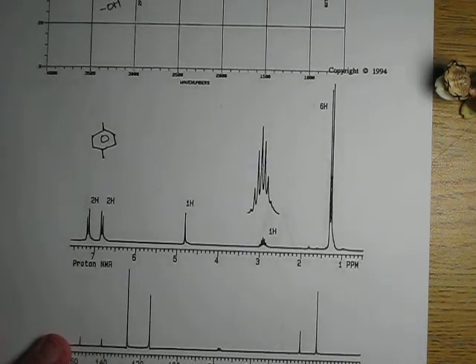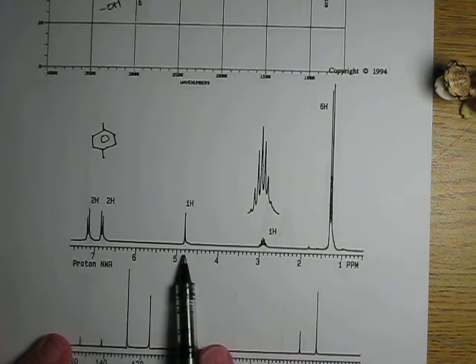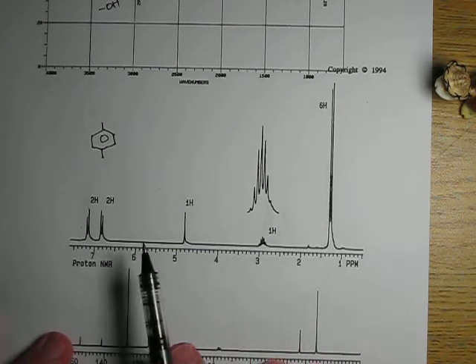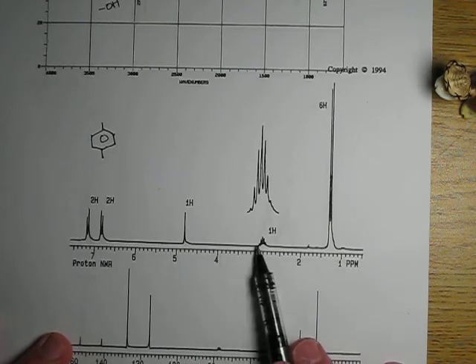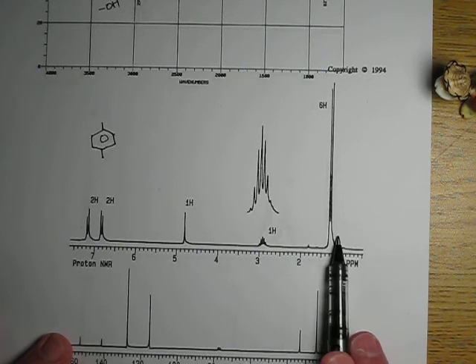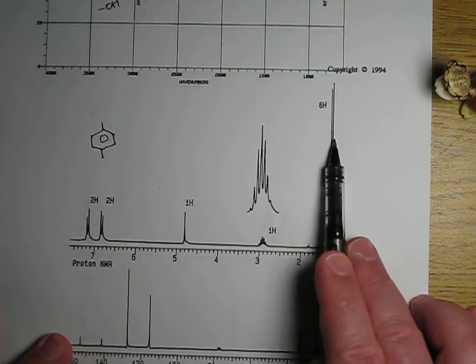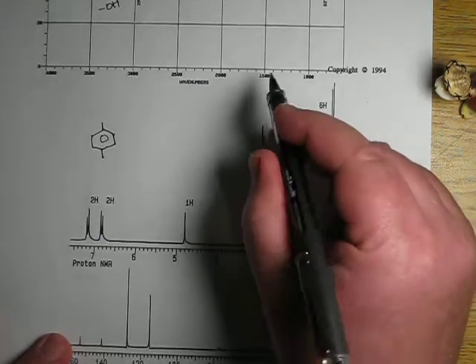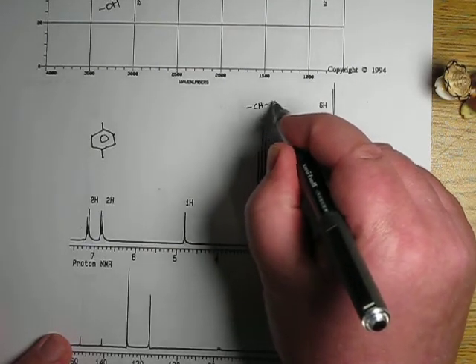All right, so let's move down. We've got a peak at 4.8 ppm. It's a singlet, and I have no idea what that is. Okay, let's move on. Let's not worry about it. Oh, wait a minute, because I know what this is. What do I have screaming at me right here? Integrates to 6, and it's a doublet, a multiplet. That's an isopropyl group. This is screaming isopropyl at me. Yes.